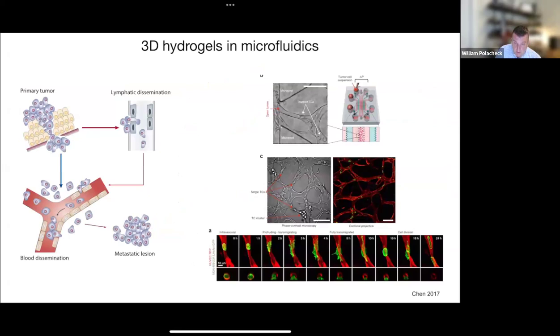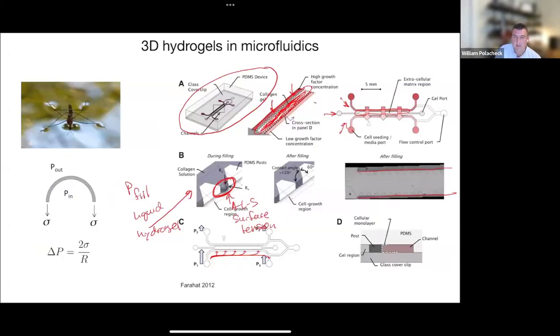So I have a question for the microfluidic. Sure, yeah. So you mentioned that the main purpose of this design is to, I guess, prevent maybe fluid flow into a certain channel.